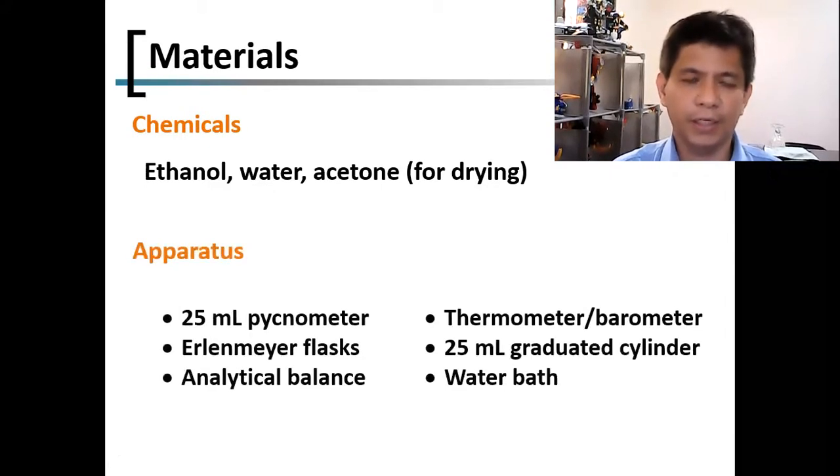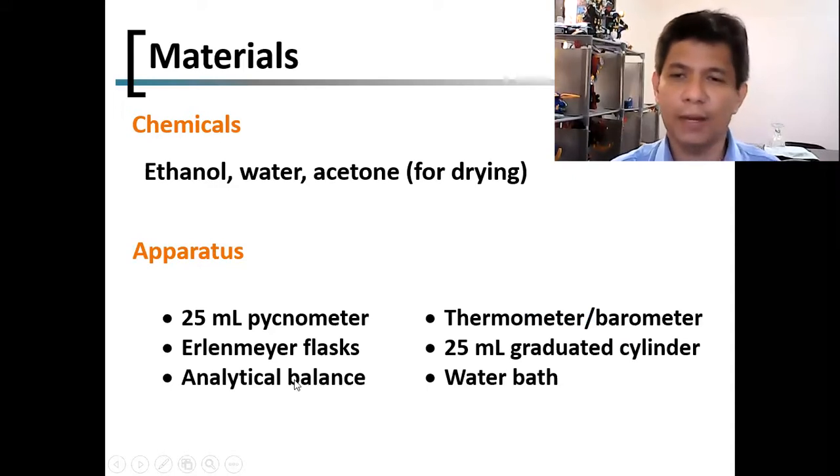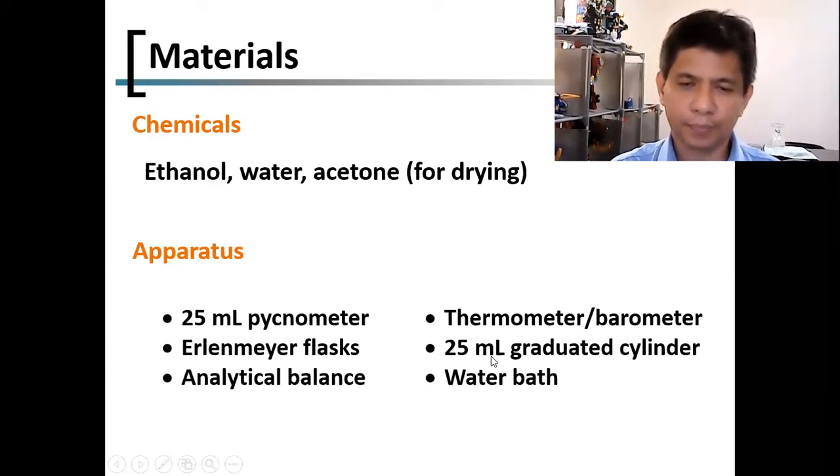And then these are the apparatus or the equipment. We're going to use the Erlenmeyer flask. And then on part 2, we're going to use a 25 ml pycnometer. Of course, you're going to determine the temperature, so we have a thermometer and barometer. And then an analytical balance to determine the weights, and then the thermostated water bath. And then in adding a specific volume, we can use a 25 ml graduated cylinder, or a pipette.